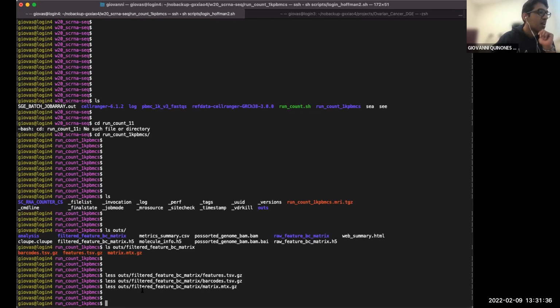Here I wanted to start by mentioning that this type of data, the 10x single cell RNA sequencing data, comes with a software called Cell Ranger. The amazing thing about this software is that all those steps that go from raw FASTQ files to aligned data to get feature counts, it can perform all of that in a single step. So I ran Cell Ranger on that data, and I just wanted to show you the feature count, which will be our starting point today.